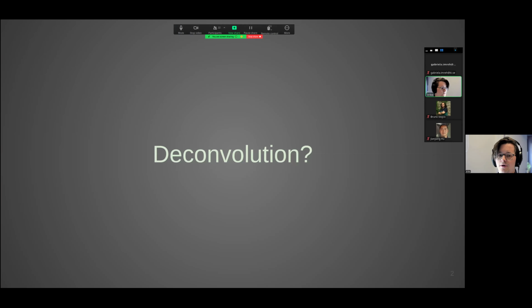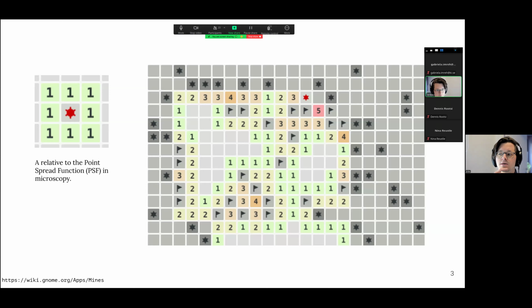If we were in a class, I could ask you how many used deconvolution before. I would just assume that some of you did, some of you maybe don't. I will spend now 3 slides just to explain what it is in the quickest possible way. I will start with this game. This is called Minesweeper, and you can find it online. If you've played it, great, because this gives a very good intuition about what deconvolution is and what kind of problem it tries to solve. If you haven't, and this looked strange to you, play it afterwards. I assure you it will pay off in 10 minutes.